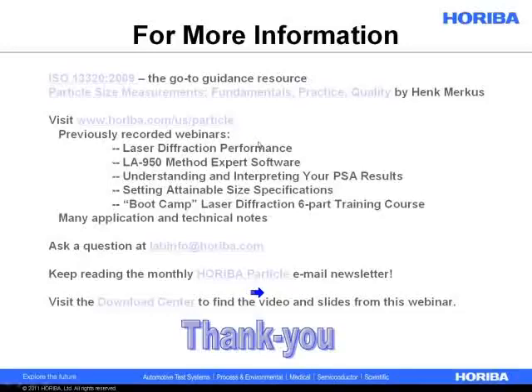You really need to, especially in the LA950, drop the transmittance. If it's not a colored material, if it's not very absorptive, not very reflective, you really need to drop the transmittance down to 50, 40% transmittance to even get close to starting the multiple scattering regime. It's a good question, though, because sometimes it can be difficult to know when multiple scattering starts and when dispersion ends, because they both show up the same way.